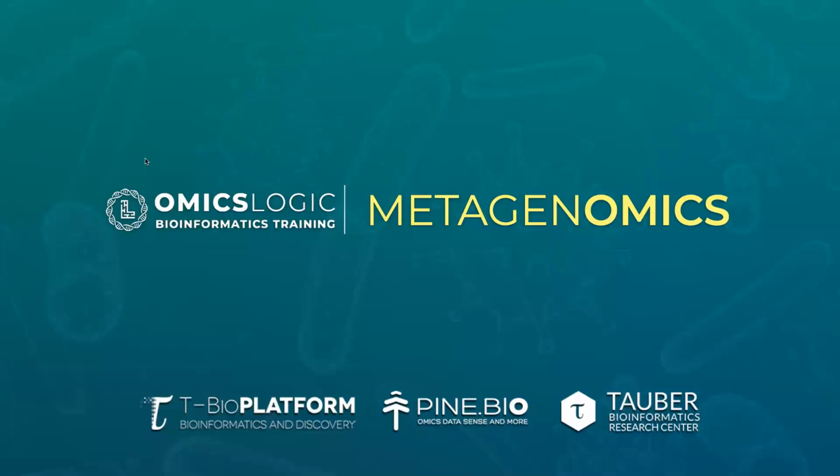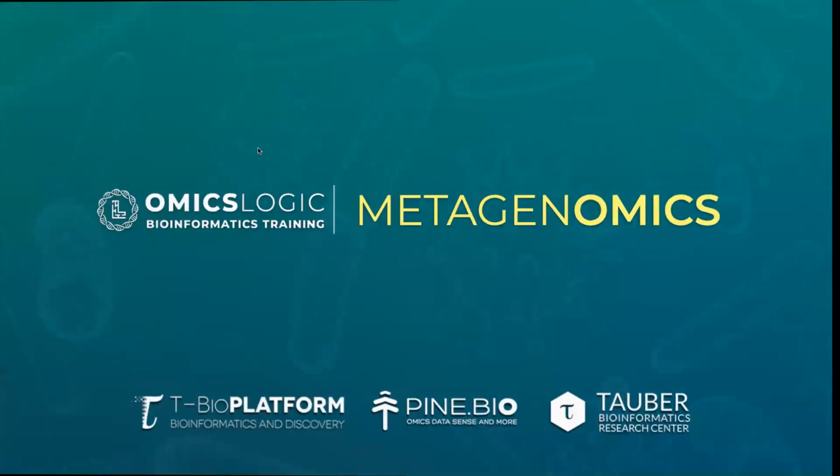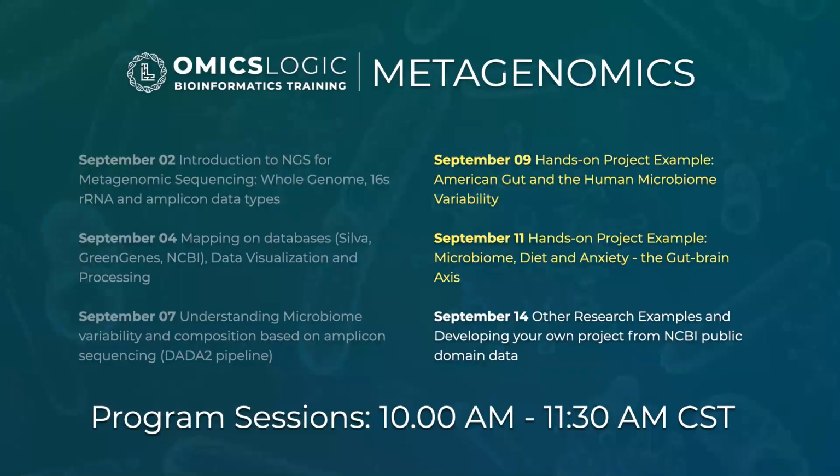those. All right, so today we're going to continue speaking about microbial communities, and today is the second project. The second project that we'll do is related to diet and anxiety. We'll briefly look at the results and discuss the different inputs and outputs, but we'll also touch on another project where it is much more clear what the differences are, but we'll do that using phyloseq based on already processed data.